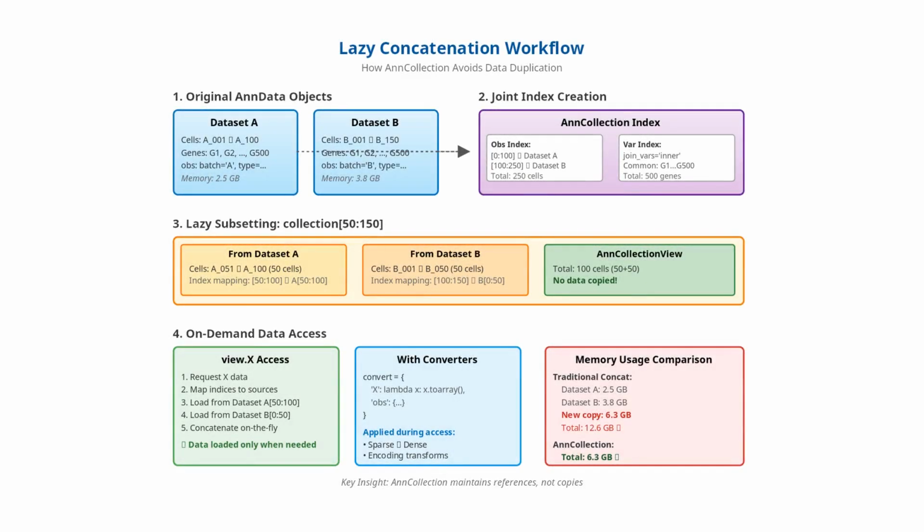AnnCollection offers flexible join strategies for combining datasets with different annotations. The join_vars, join_obs, and join_obsm parameters control how metadata is merged. This diagram shows how the lazy concatenation flow works with different join strategies.